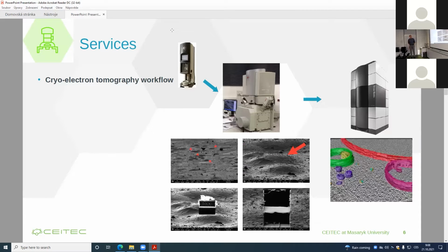All right, the other workflow that has been established here since the very beginning is the cryo-electron tomography workflow that is based either on plunge freezing of the sample and then directly collecting cryo-electron tomography data, or in a more complicated way, you then transfer your sample into this cryo-FIB-SEM instrument in order to observe the cellular samples and use the cryo-FIB to cut or mill a thin lamella from your cell for the in situ structural biology studies, and then go back to the cryo-TEM for cryo-electron tomography.